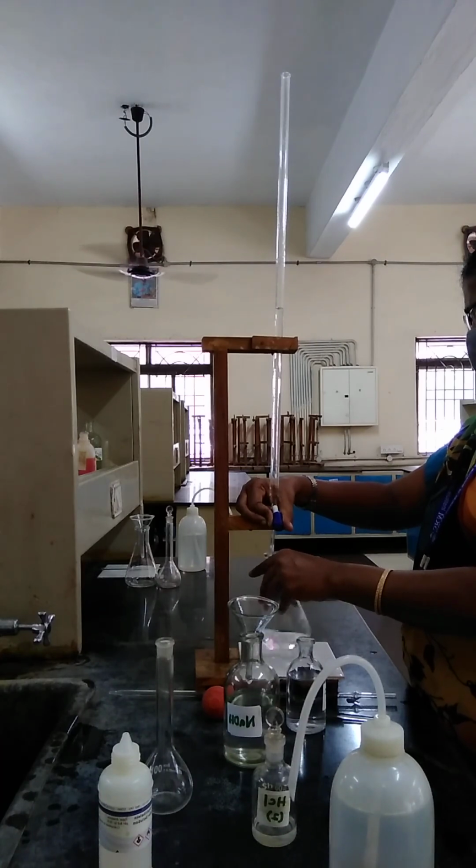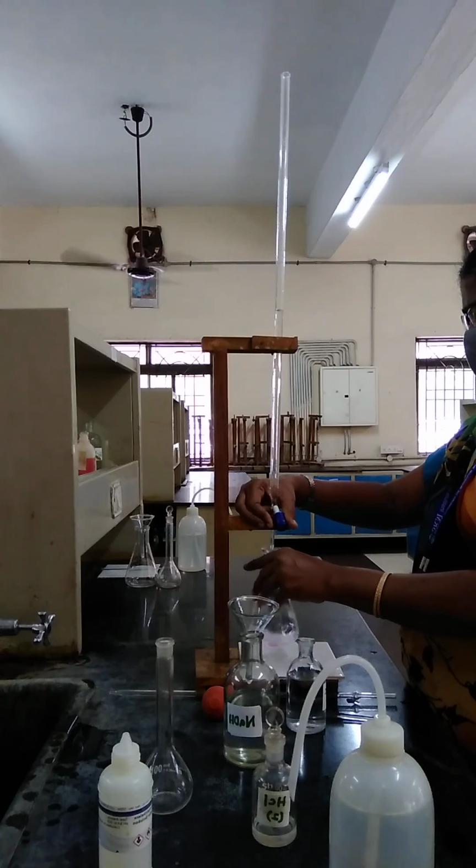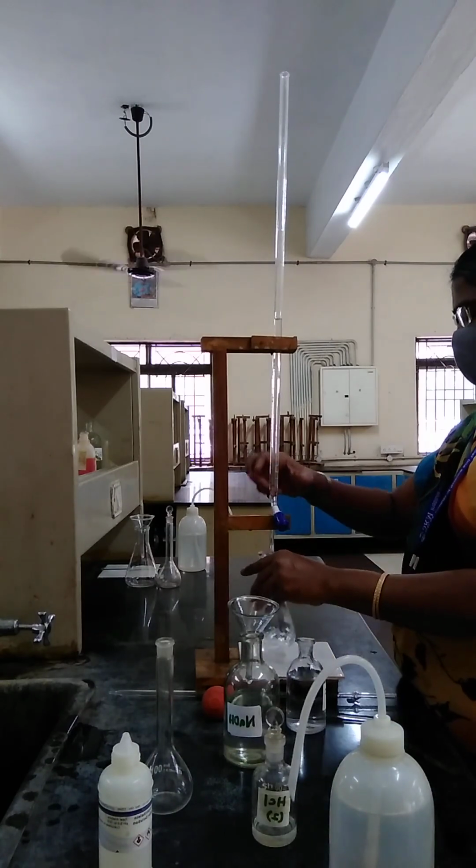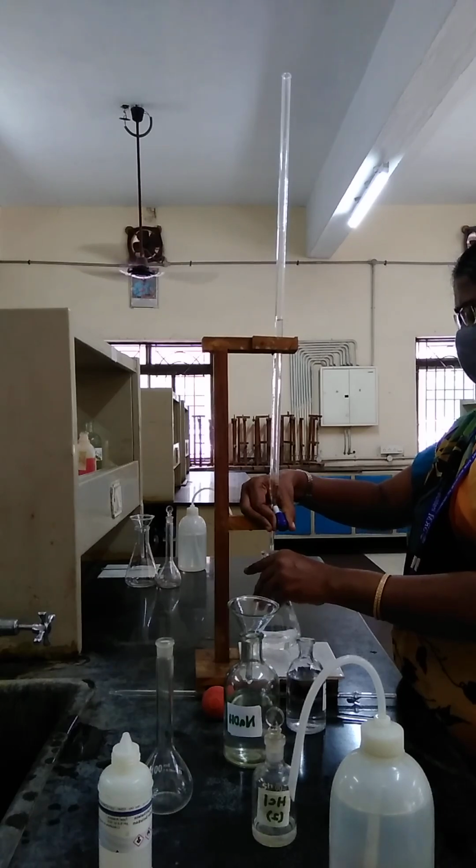Before the 5 ml, you can slow down and go dropwise to get the exact value, what we call the concordant value. So what is the concordant value? Successive titration values are supposed to be the same. Only then we call it the concordant value. The titration we have to continue until the concordant value. Once we get it, we stop the titration, note down the reading, then do the calculation. We can go for the next titration.